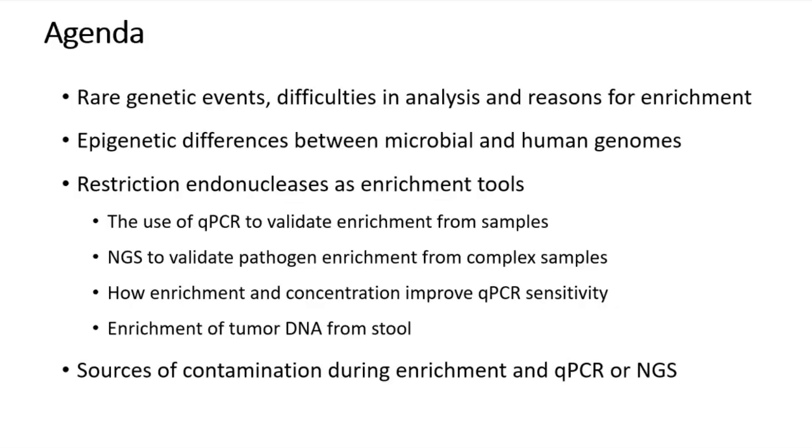The agenda that I want to go through is a little ambitious, but in our lab, we look at a lot of rare genetic events, and I want to sort of define those for this audience and talk about some of the difficulties that come up in handling those and some of the good reasons for enrichment.